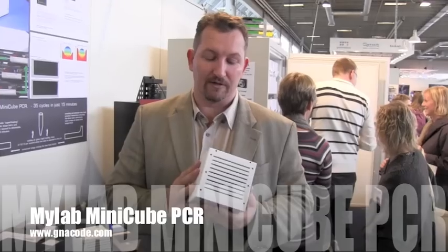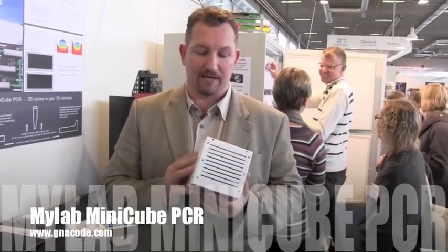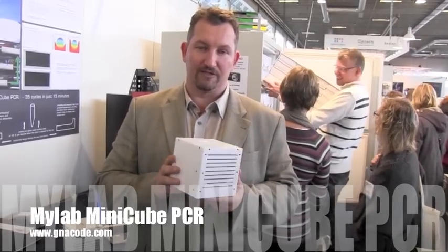It's also a very low-cost device. The price is quite good — you can check that out at the link in the video. But I'll explain a little bit about the principle of how we achieve the fast PCR.